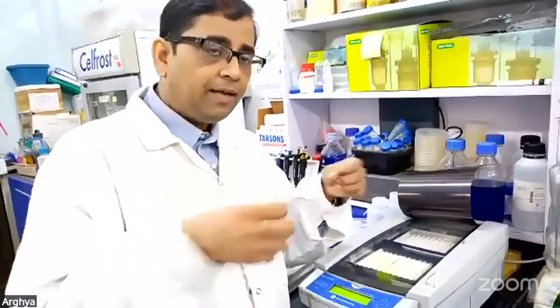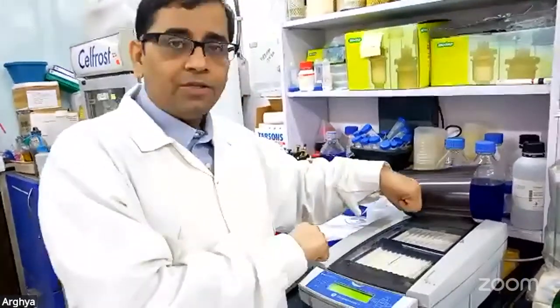And that's where initially we keep a very low voltage in the setting. We keep 200 to 500 volts for a few hours so that any kind of salt and things get absorbed in the edges. And over time, we ramp up and change the voltage. We initially go to maybe 2000 volts, and then after a few hours we change to 7 or 8,000 volts, and we try to achieve the volt hours, not only the voltage.